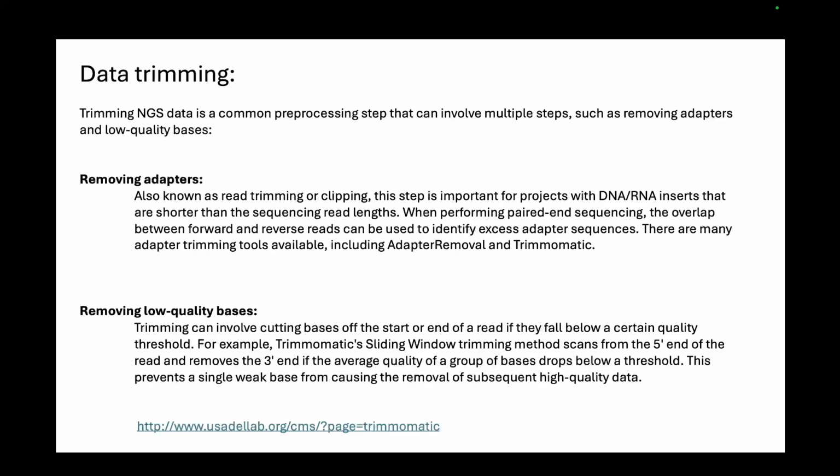Now, we have this reference genome, which is an already sequenced, whole sequence of the human genome, for example. So the human genome has 3 into 10 to the power 9 base pairs. So it's 3 billion base pairs inside the human genome. And you only have reads of 150 base pairs or 300 base pairs. If you combine read 1 and read 2 from Illumina, that together comes up to 300 base pairs.